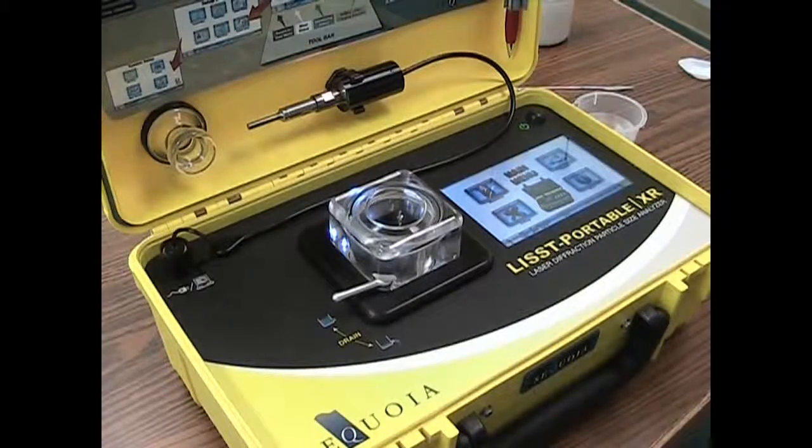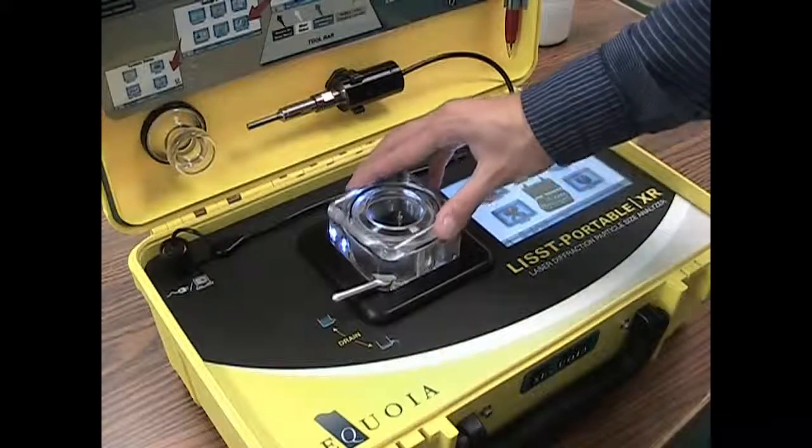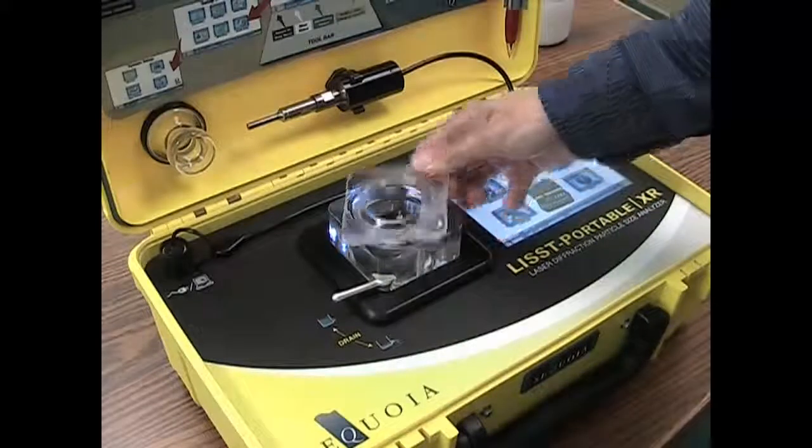Start by removing the top cover of the sample chamber. It's easiest to twist the cover first, then lift the cover off by one of the corners.